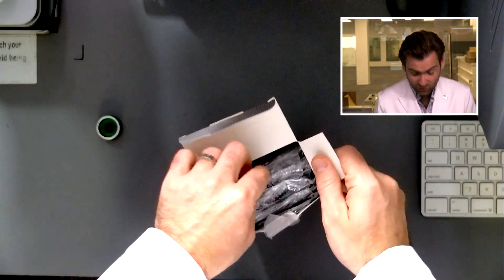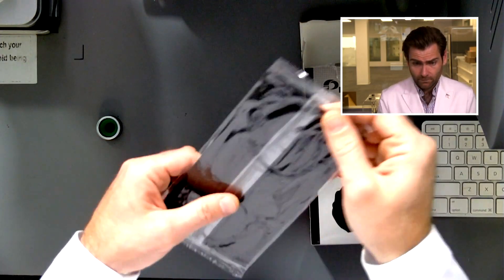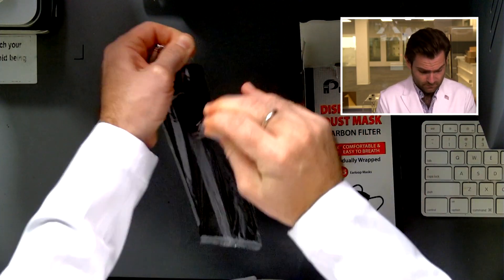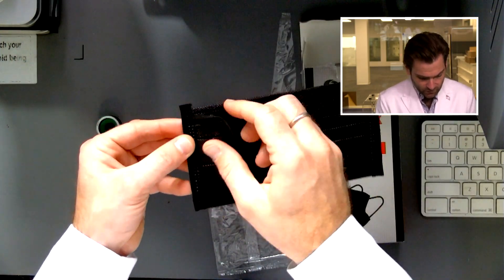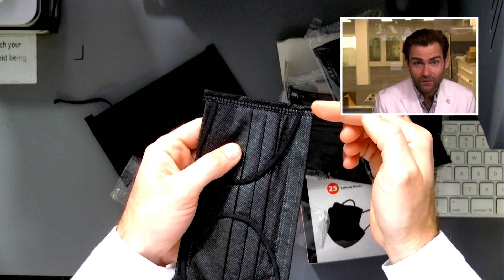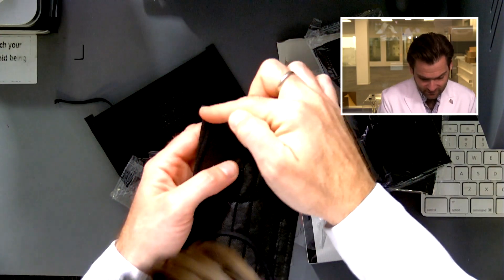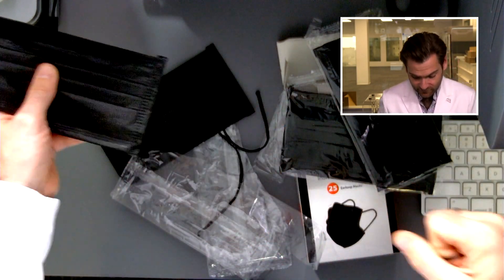Let's open this up. These are all individually wrapped, which is really cool. 25 masks, less than a dollar a piece — that's pretty good. This is a Taiwanese-style mask with ear loops that fold over, which makes them super strong — unless you do it wrong. This is the least strong ear loop I've ever used. What's supposed to happen is you fold this over in the production process and do an extra layer of welding, which usually makes these super strong. But whoever did this did not put it together very well.